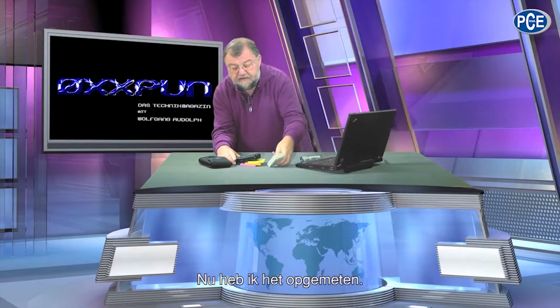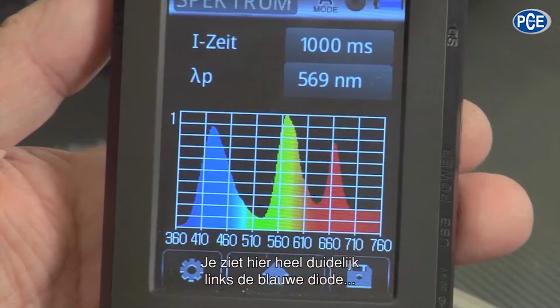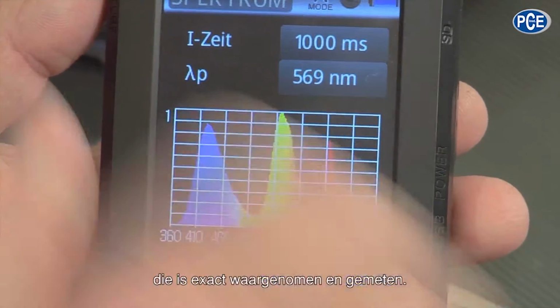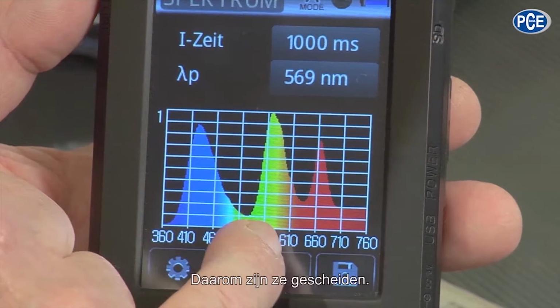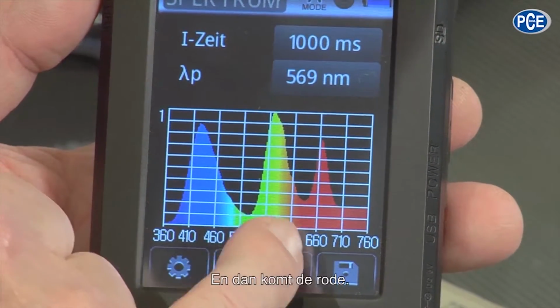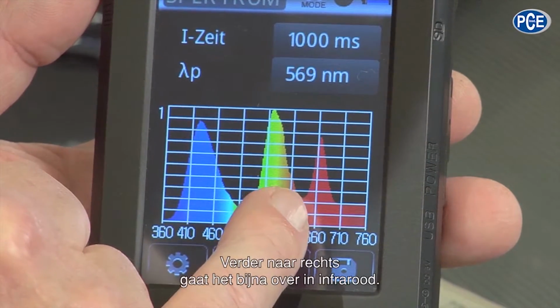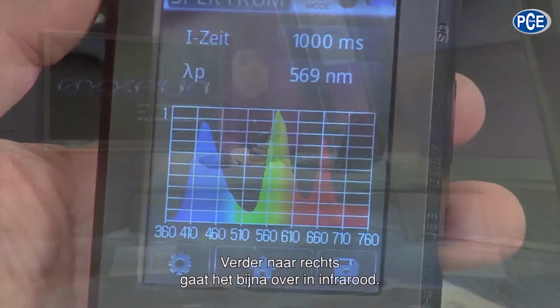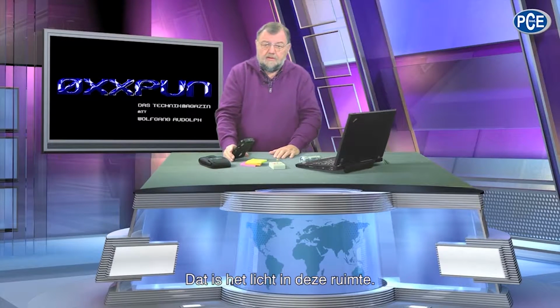So now I have recorded it, and you can see very clearly here, on the left the blue diode is exactly seen and measured. Green and yellow lie pretty close together in the spectrum. That is why they are divided. And then comes the red one. And further to the right, it goes nearly into the infrared. That is the light in here, the room lighting.